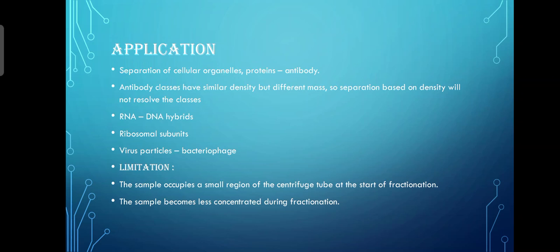There are some limitations. The sample occupies a small region of the centrifuge tube at the start of fractionation. The sample becomes less concentrated during fractionation.